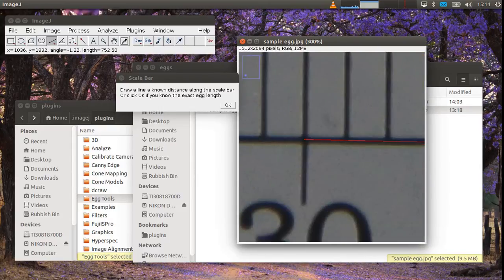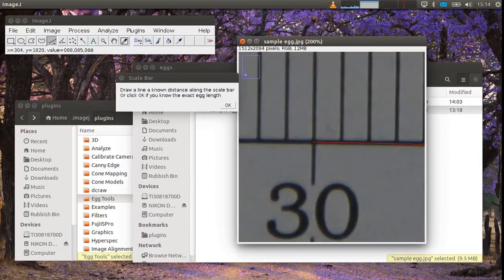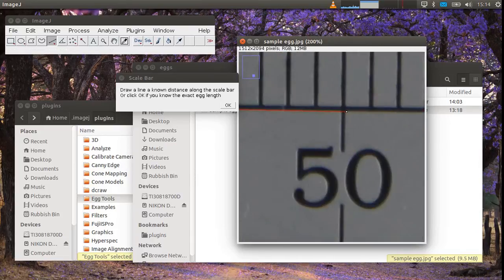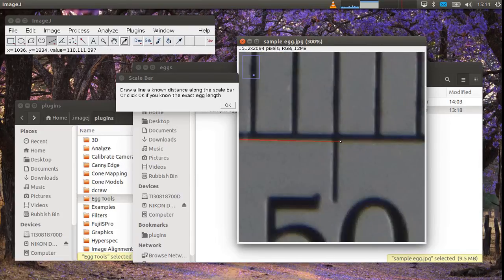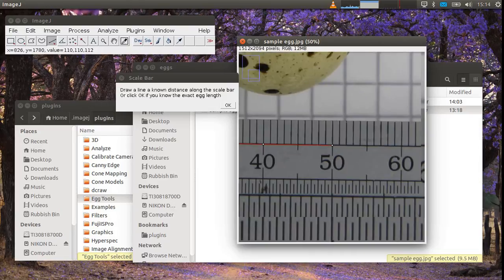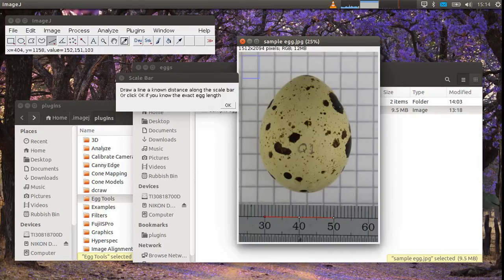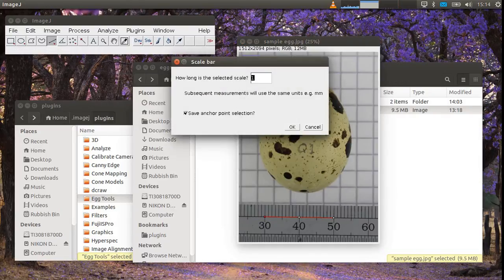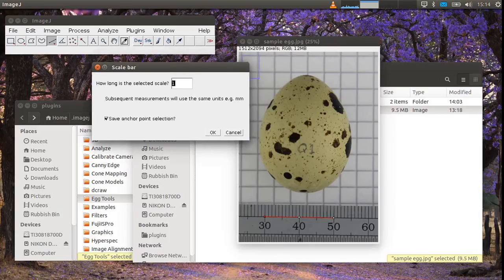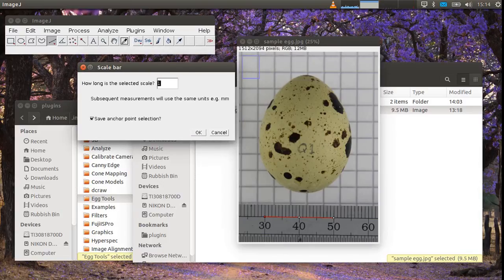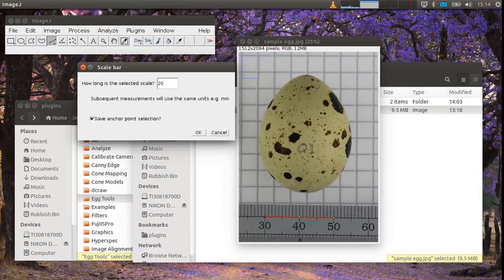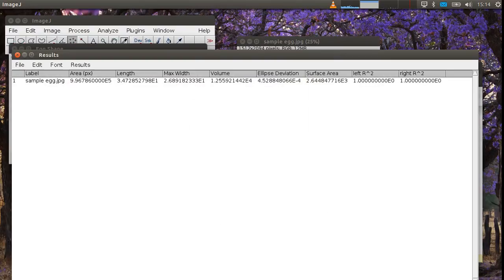And make sure you get the points on the line as accurate as possible. There we are. And once you're happy press OK. You'll then be asked how long that selection of rule bar is that you've just selected. In this case it was 20 millimeters. And I'll leave this ticked because this will save the selection later on. Press OK.